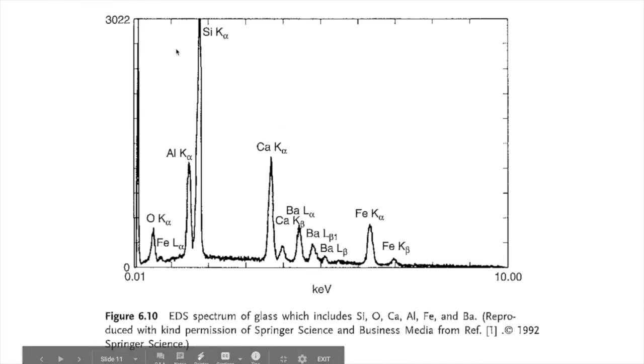And so this is what we're expecting in this spectrum. So if we walk through a typical spectrum, we tend to run the detector and scan a certain level of energies. So in this case, the scan is from 0 to 10 keV, but another common range would be 0 to 20, and so forth.